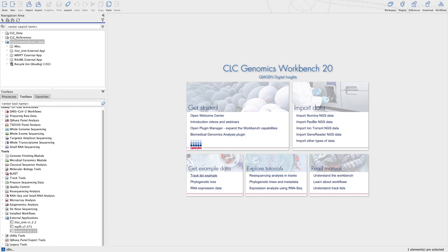And so as we wrap up this series, hopefully throughout these videos, you've been able to gain a stronger understanding of these genomics server external applications, and you can start seeing how you might implement this process to extend your genomics workbench toolbox to include really any analytical tool that your laboratory may need access to.